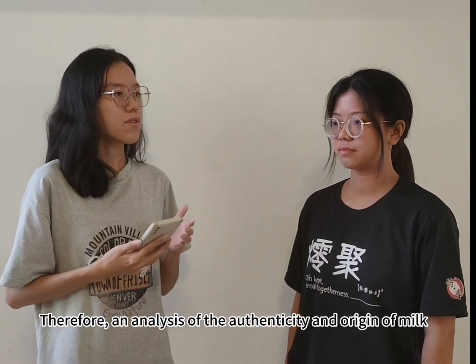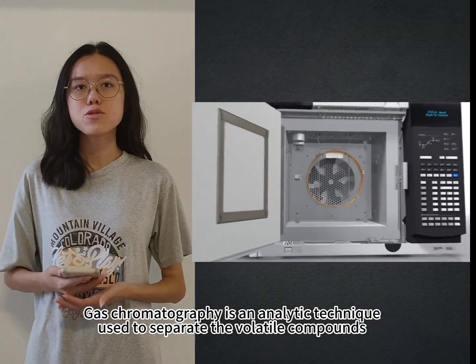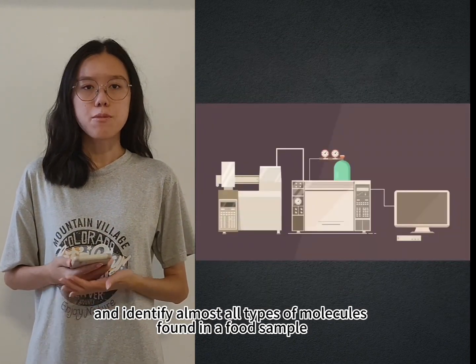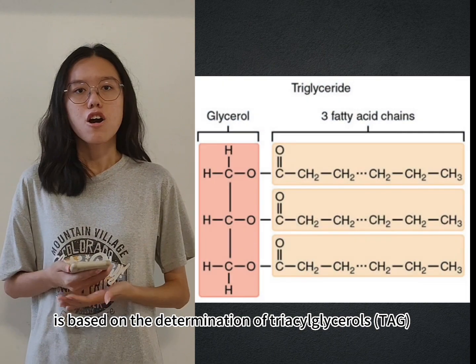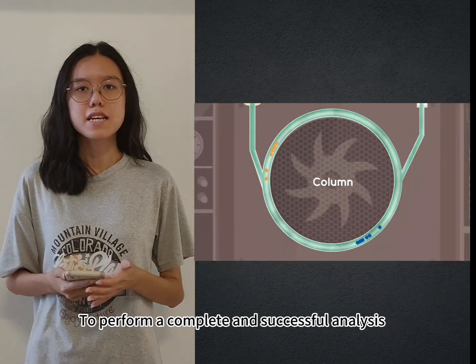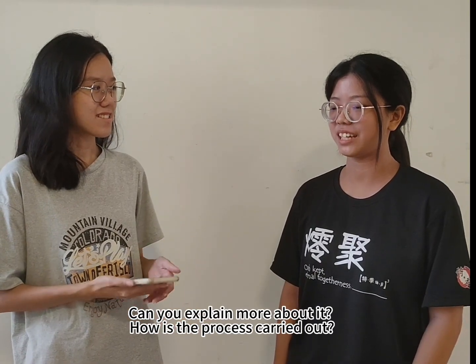Therefore, an analysis of authenticity and the origin of milk can be carried out using gas chromatography, also called GC. Chromatography is an analytical technique used to separate volatile compounds and identify almost all types of molecules in the food sample. The authenticity analysis of milk using GC is based on the determination of triacylglycerol (TAG). To perform a complete and successful analysis, GC is usually combined with FID, a flame ionization detector. Can you explain more about it? How is the process carried out?